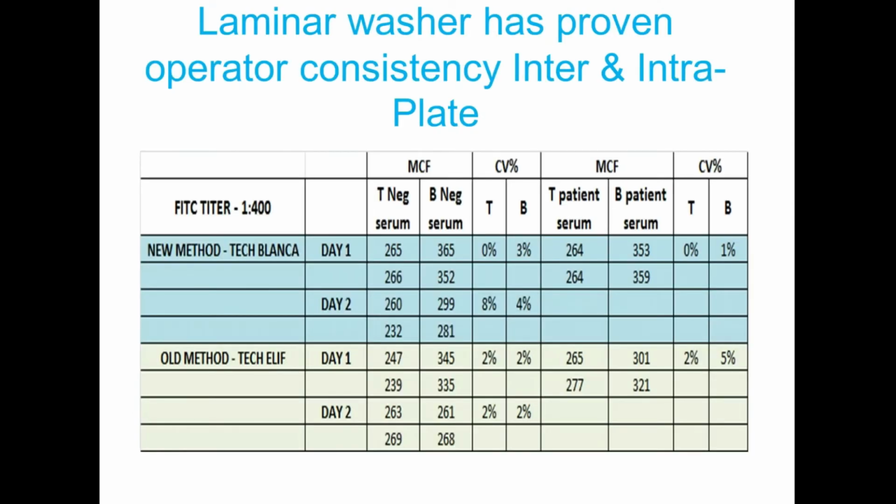One of the disadvantages of our current wash method, or of all non-automated washes, is that there is always variation in MCF results generated from tech to tech and from plate to plate. Our lab has had the good experience of training several lab techs, and at one point, we had 3 to 4 techs routinely perform flow crossmatch. As our hospital runs crucial samples several times a day, we face the challenge of consistency of processing these samples, and especially with washing.